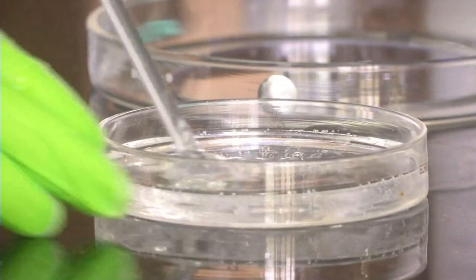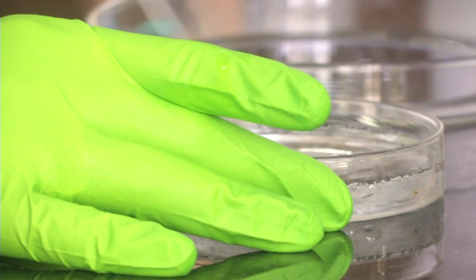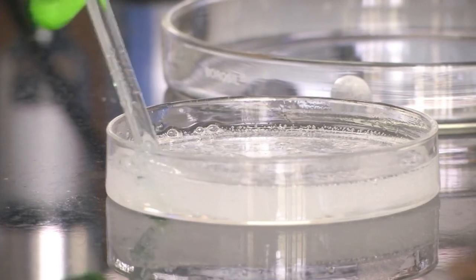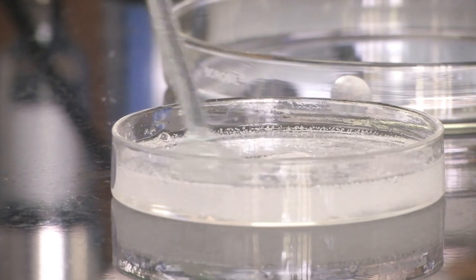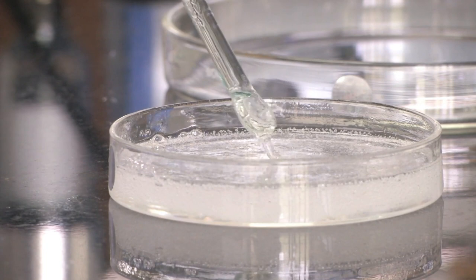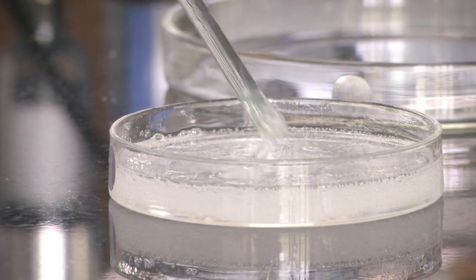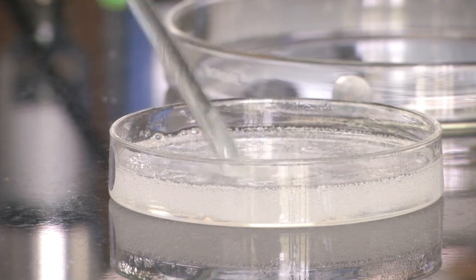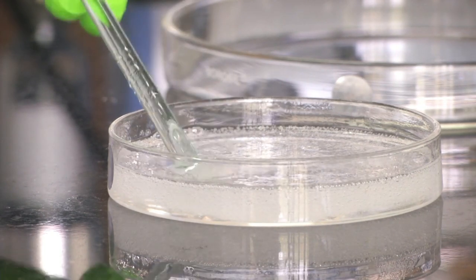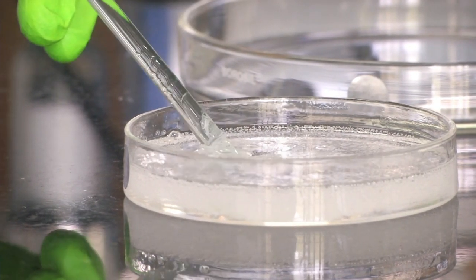We have to stir it for almost 10 minutes. We have now thoroughly mixed the PDMS and curing agent for more than 10 minutes. You can see the mix now - it is full of bubbles. We cannot use it directly. This is the mix we need to make the mould, but with these bubbles, once we cure it, the bubbles will form part of the layer and it will not be transparent. We need to remove all the bubbles.